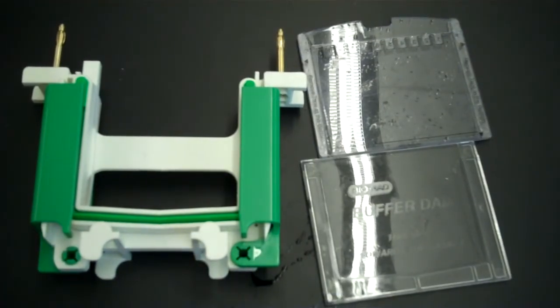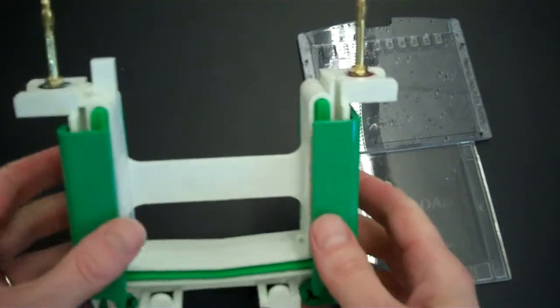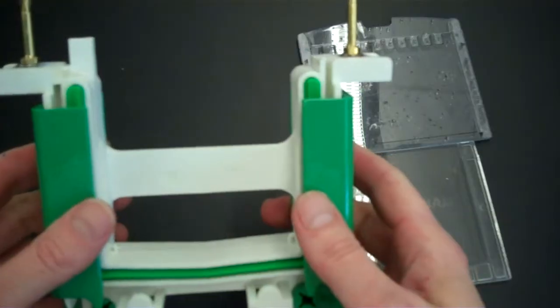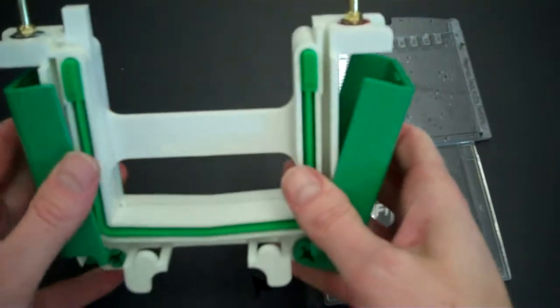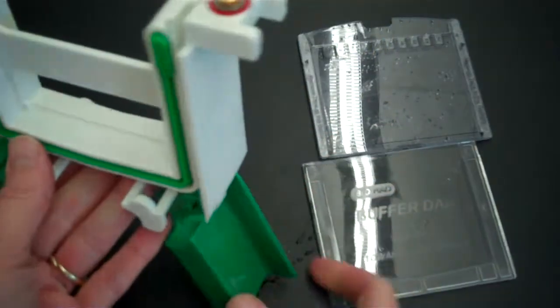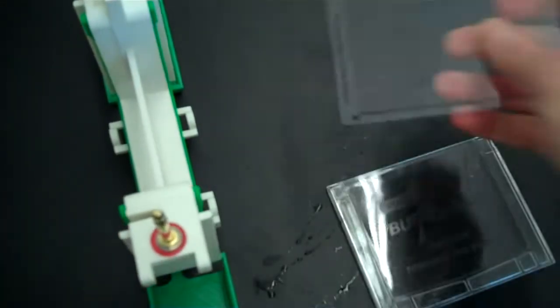So what we're going to do next is assemble the inner chamber. For that, you will need this piece of equipment that came within your electrophoresis box. And it has these little green wings. And you're going to open them up. Next, you have your gel.